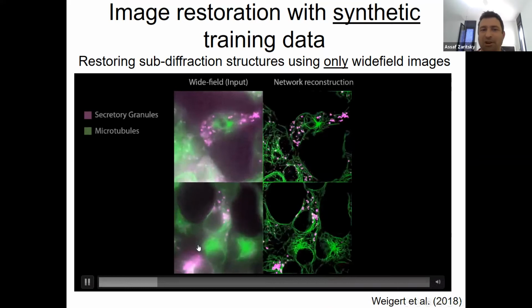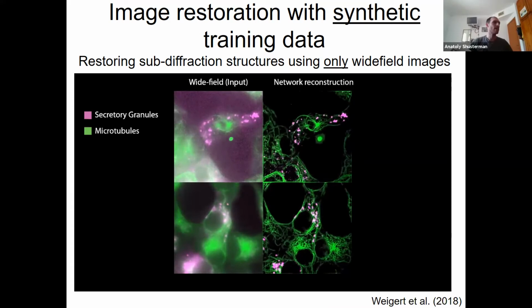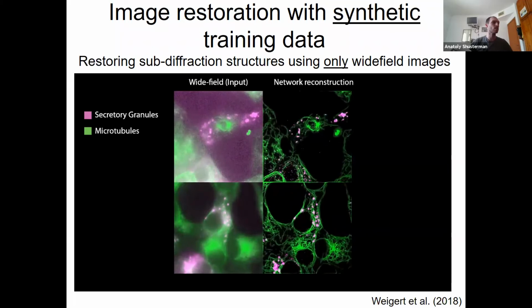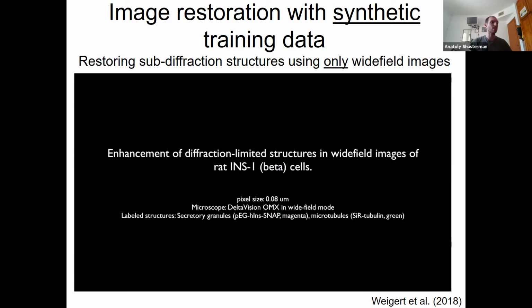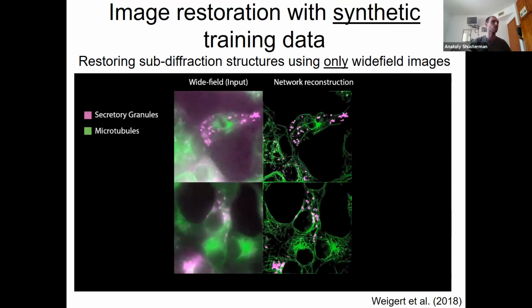I have a question. You can see all of these images and videos really look nicer after the reconstruction by the networks, but do we have any metric that supports that the reconstructed network output is better for the analysis?